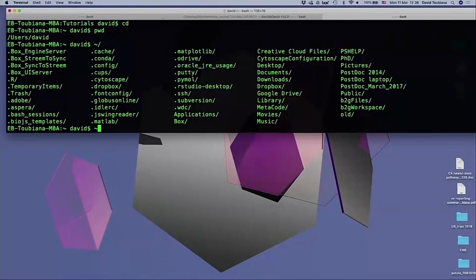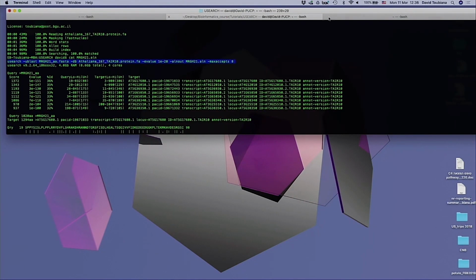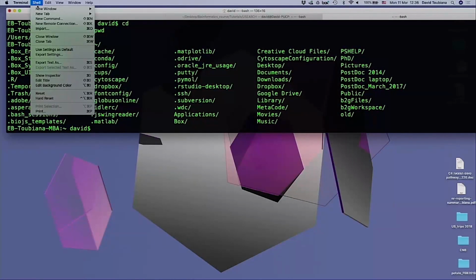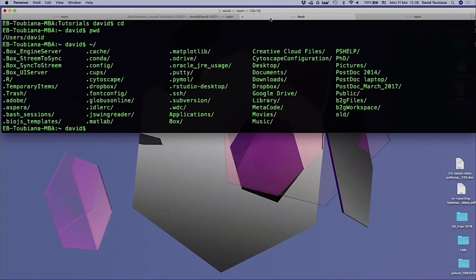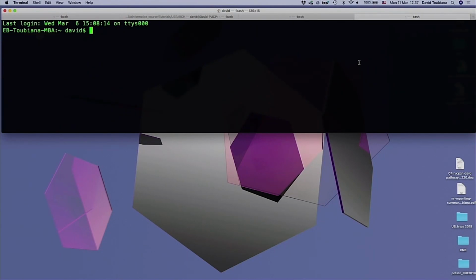Okay, so also what I wanted to show you, if you see here, I basically always have open a few tabs when I use my shell. Okay, you can do the same. And you should do the same. Why is that? So let's say I have here in my bash, I'm looking at my files, I want to know what files I have here, but then I want to do some quick R operation.